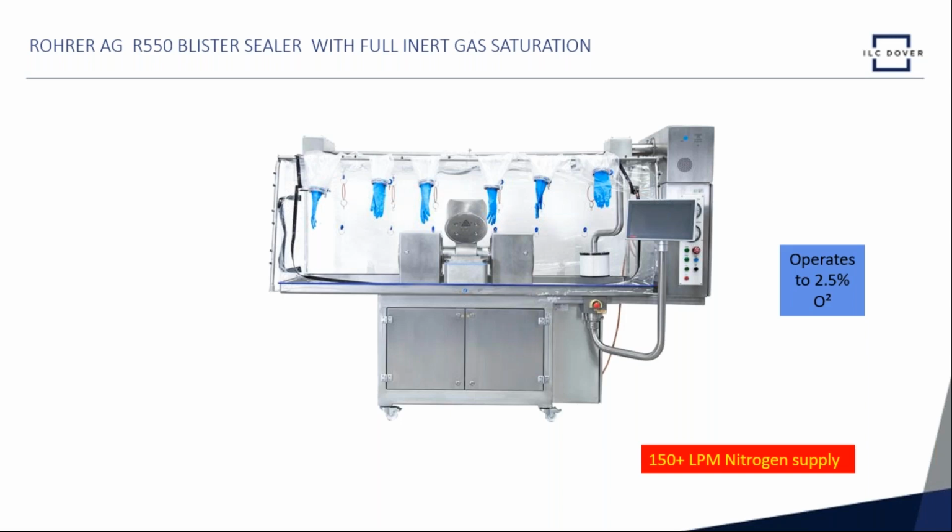You'll notice with many of these designs we are getting through rather a lot of nitrogen during the operating cycle, but we tend to bleed off the very minimum we can to maintain a safe negative airflow condition, and I'm afraid that's one of the prices we pay for the safety we get with a negative pressure operation.